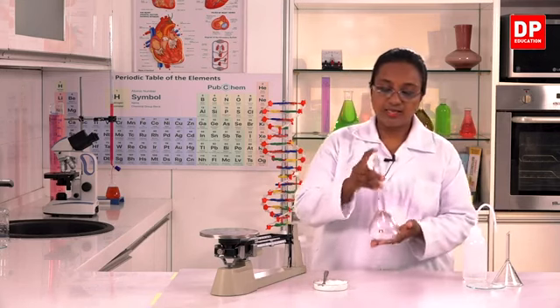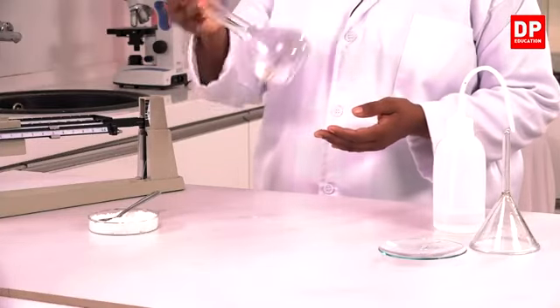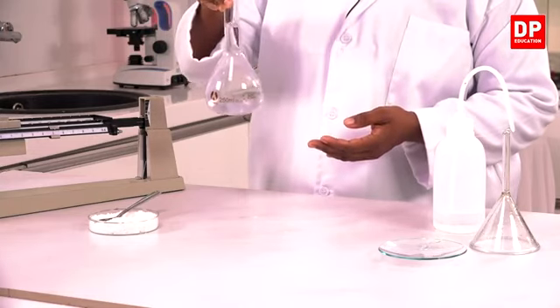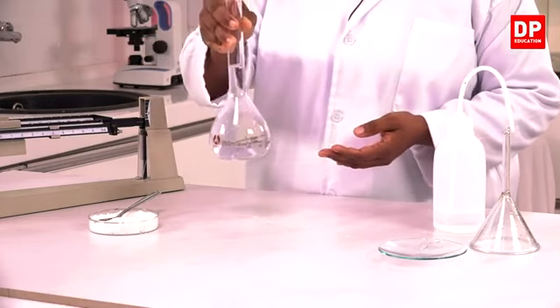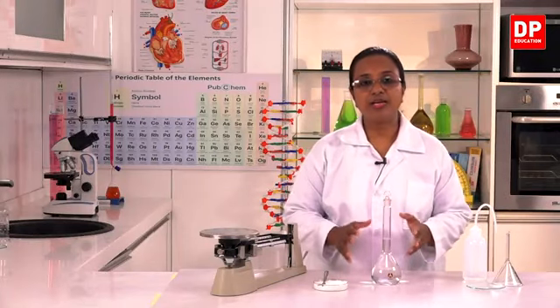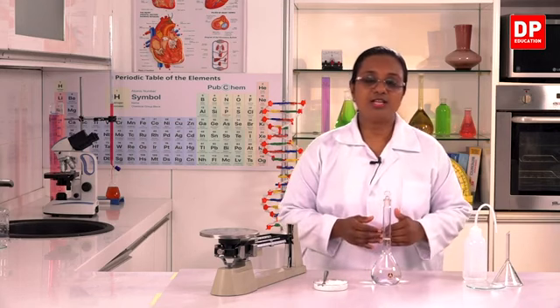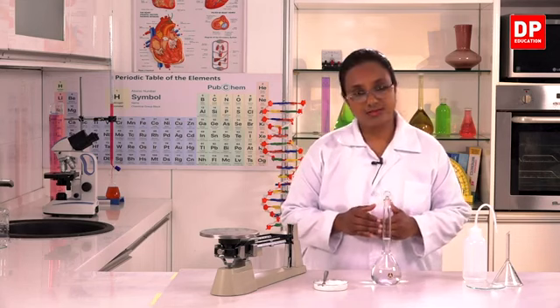So to do that, again we have to mix the solution, but we have to be careful that the solution or the solvent doesn't escape from the volumetric flask. So when I mix it well like that, the solute gets distributed evenly. So we have a solution where the concentration is uniform. So that means we have prepared a standard solution with a known concentration.